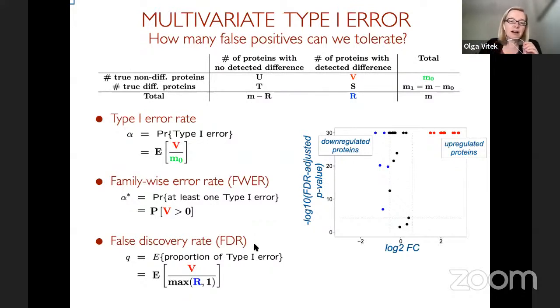So we can either change the decision boundary as I was showing here, or we can transform the p-values so that we can plot them on the volcano plot. This is quite standard, and many packages rely on that. It's numerically very robust, so that's what MSstats is using. So feel free to ask questions about that. But currently, if you look at the FDR adjusted p-value cutoff, it means that the average proportion of false positives in the list of claimed changes is as specified. So if we select the cutoff at 5%, then we expect 5% false positives in our list.